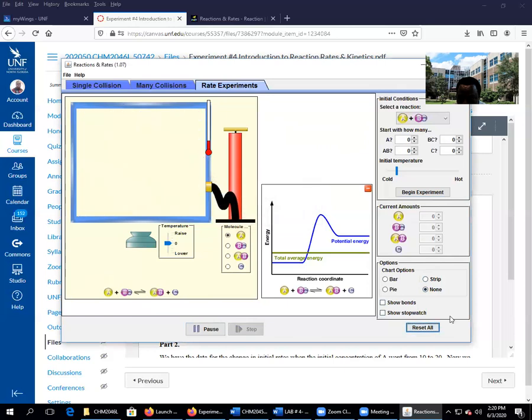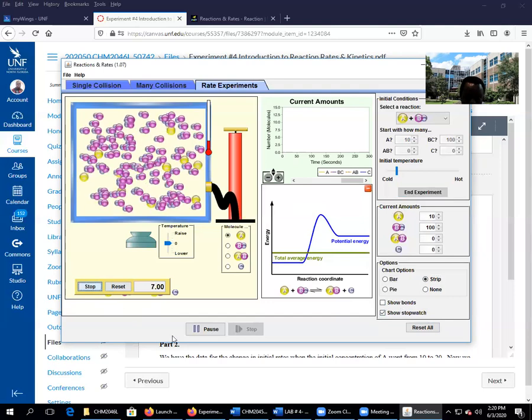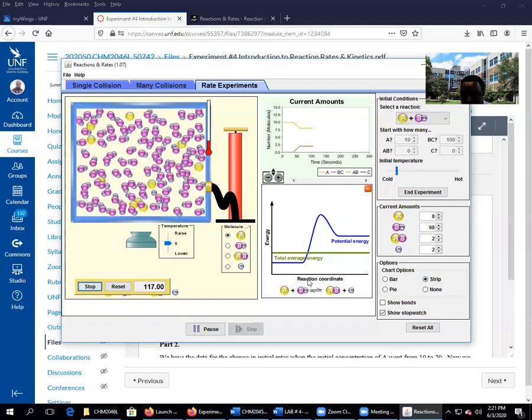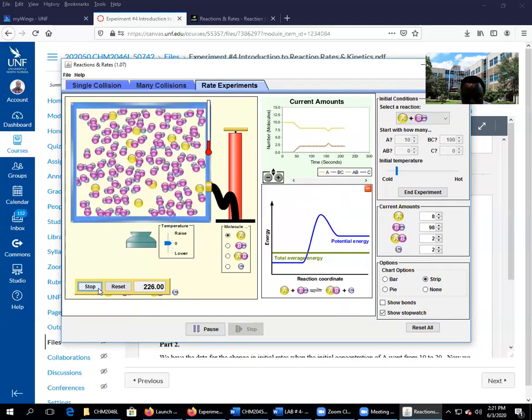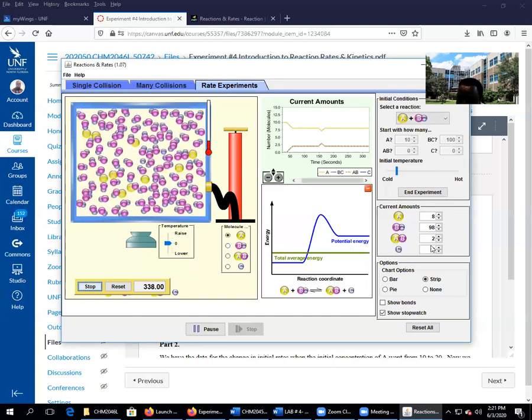Let me start over again so that you see how, until you get it 10 and then 100. Let me show the stopwatch and then have that. So if I want to start again, this is 10, this is 100. You have to click this and click that at the same time. So I'm going to do this, begin and start. There is a graph right here, so begin and start. I'll wait for this to read 5 before I click stop. Last time I did 4, which was bad. Keep an eye on C here.